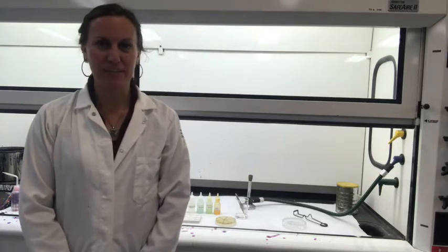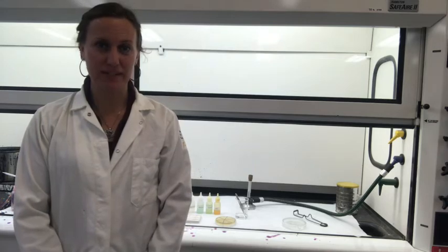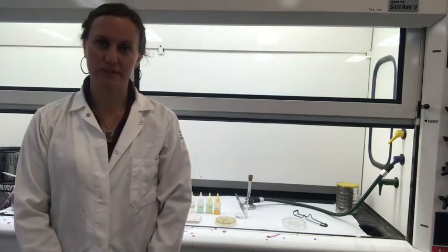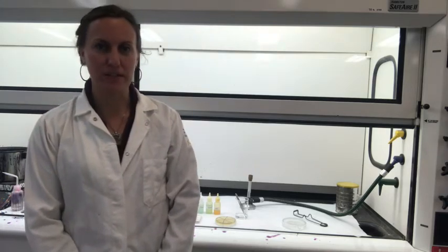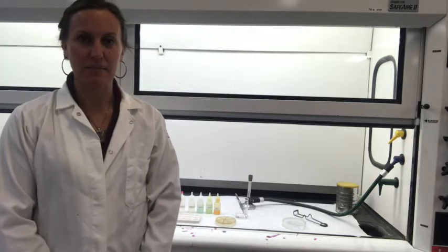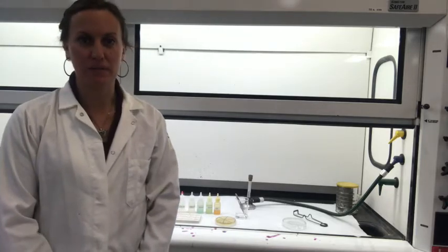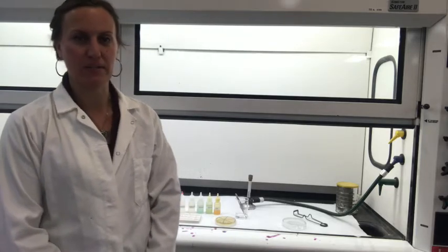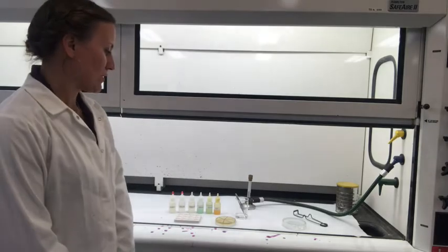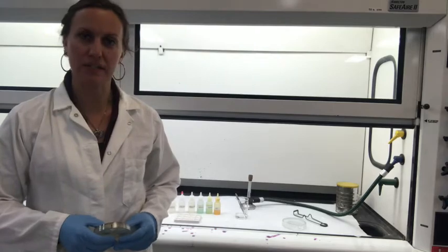So here's a demo for the disinfectants lab. For this lab, we are evaluating the impact of various disinfectants on the growth of different types of organisms. We usually evaluate gram-positive bacteria, Micrococcus luteus, Bacillus subtilis or Bacillus cereus, and also gram-negative bacteria, E. coli, and others, perhaps Serratia.